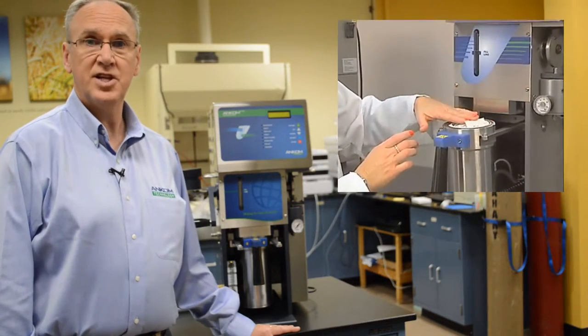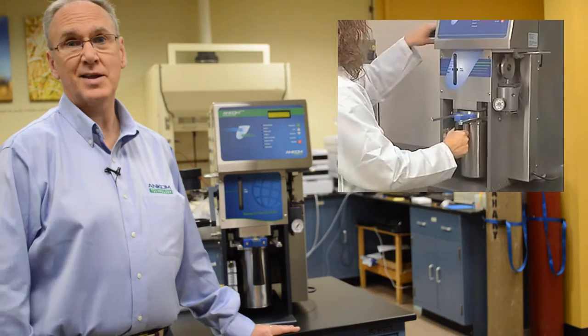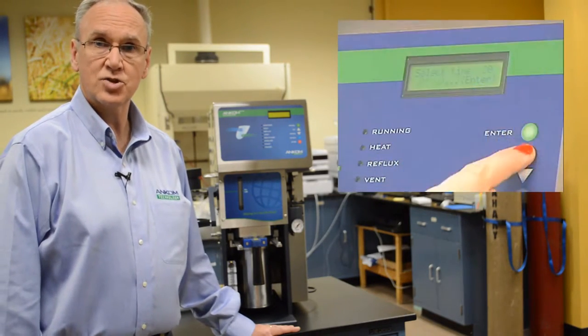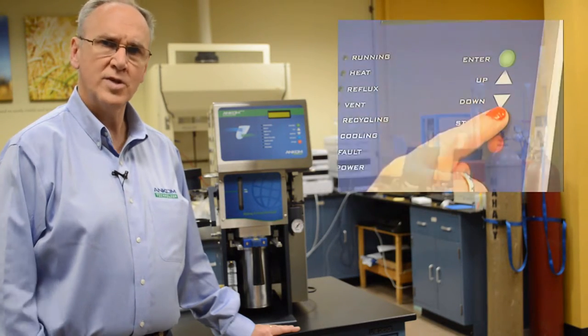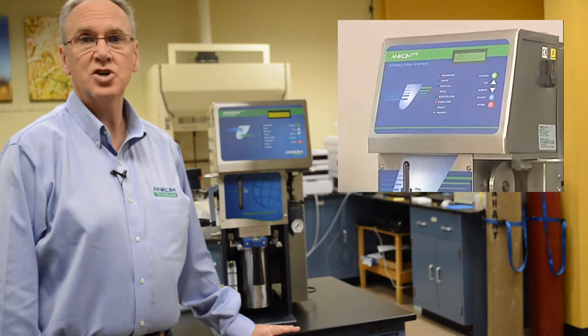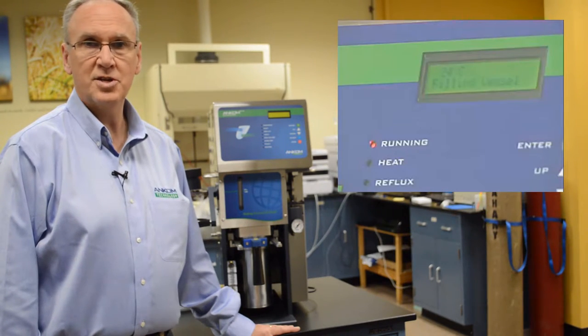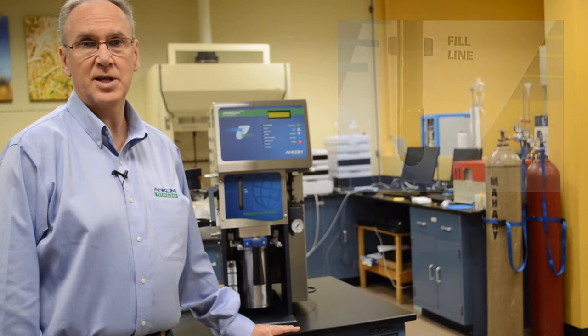The controller on the XT15 walks the technician through the entire process. The software automatically sets the parameters for the solvent selected, and the technician can set the extraction time or make any other changes he or she desires. Once the start button is pressed, the technician can walk away. The instrument does all the work — there is no need to monitor the process. The XT15 automatically handles all the steps necessary.